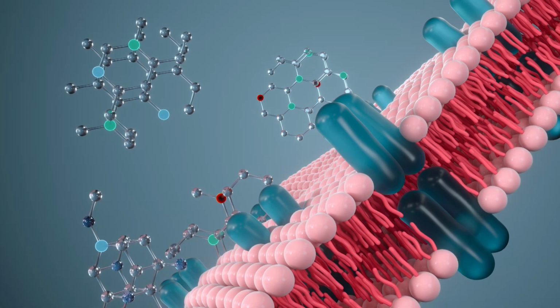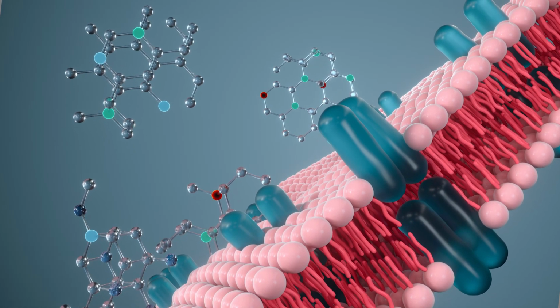I've been a mass spectrometrist for 20 years now. I am always driven by wanting to show that mass spectrometry can do more than what it could do yesterday. So I'm constantly looking at where I can bring this field further in applications as well. The field of glycobiology is a very good one because there are still so many challenges to be overcome. So where we want to work primarily is: can we detect the masses of glycoproteins and glycoprotein complexes better? Can we sequence them better? Can we get better information about which glycans are exactly attached to which protein, under which physiological condition? I can go on and on and on. There is still a lot of work to do.